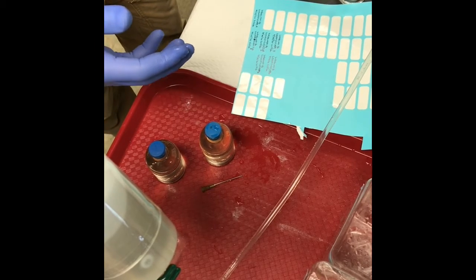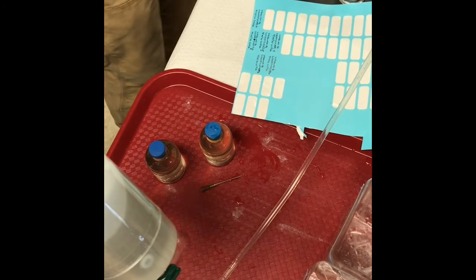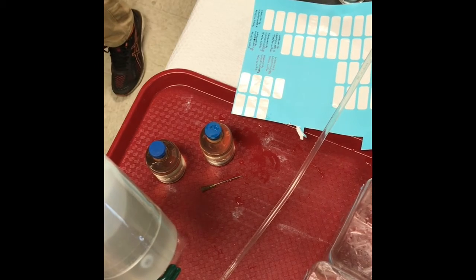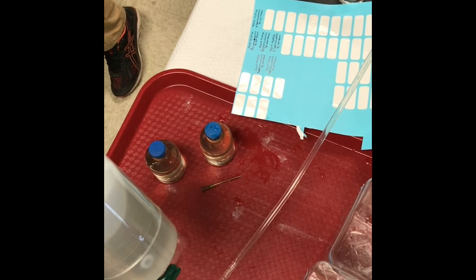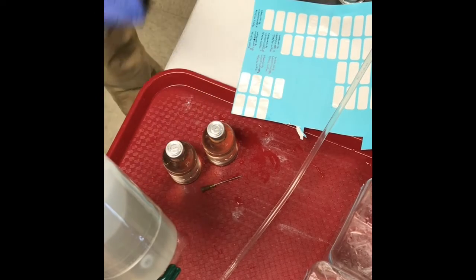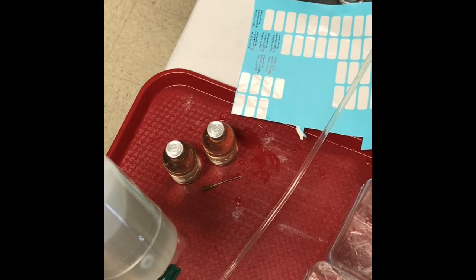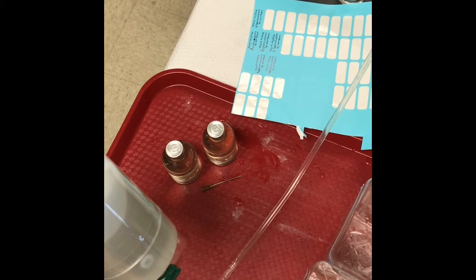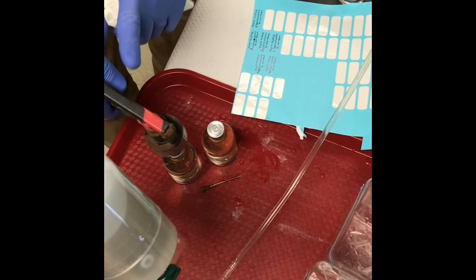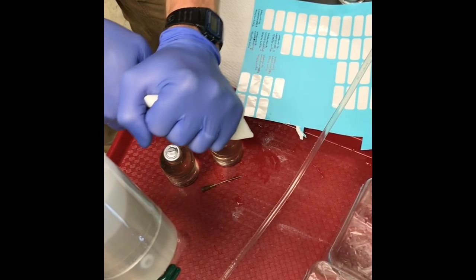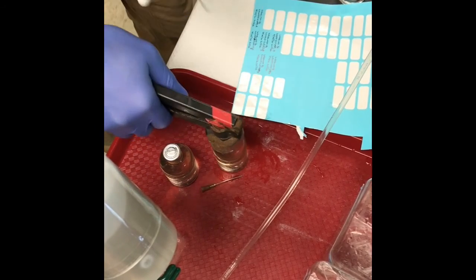If we want to keep them secure, we can also add a crimp cap lid. We'll just put the lid on top, use the crimper to push down first, and then it won't accidentally come off during storage.